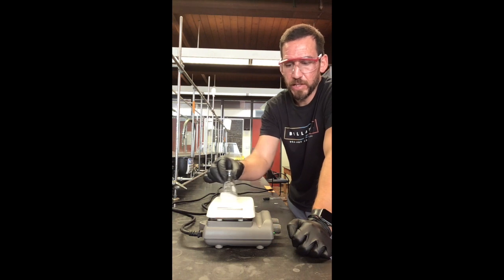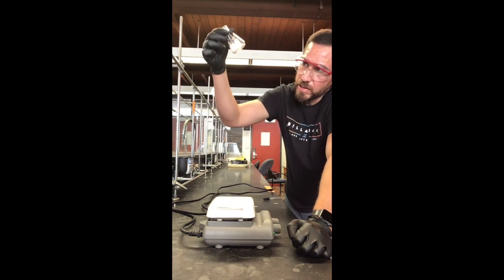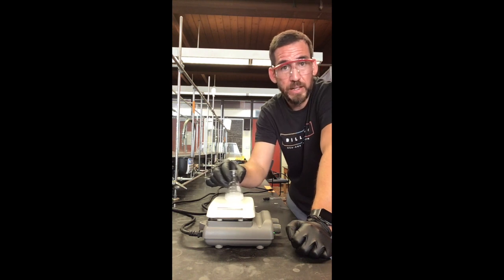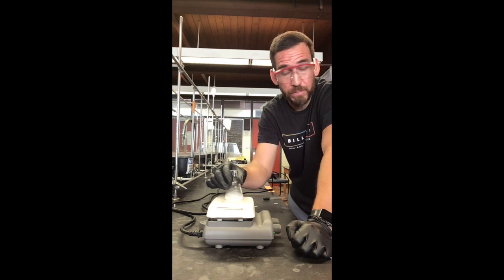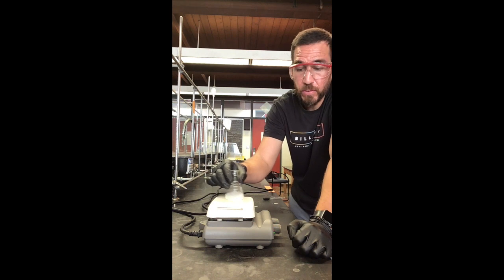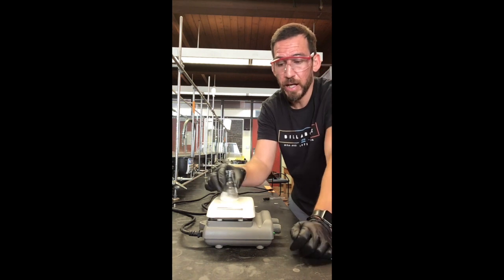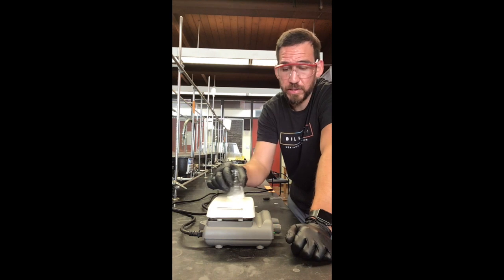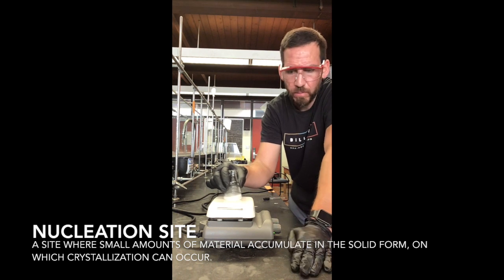And so I'm going to constantly stir this. Again, if you let it sit there, it can heat the solid material on the bottom and then cause that oil that we don't want to have, and oil out. Okay, so we have to be constantly stirring this. You can also throw a stir bar in here and then turn on the magnet to have it stirring. And that stir bar is going to create a nucleation site for crystals to form on, but then you've got to scrape it off of the stir bar, and it's just a whole thing, right?